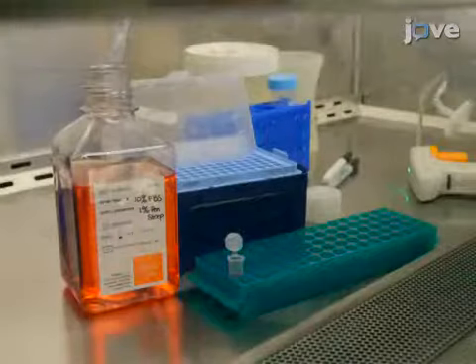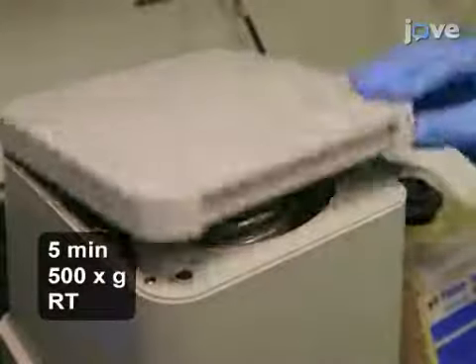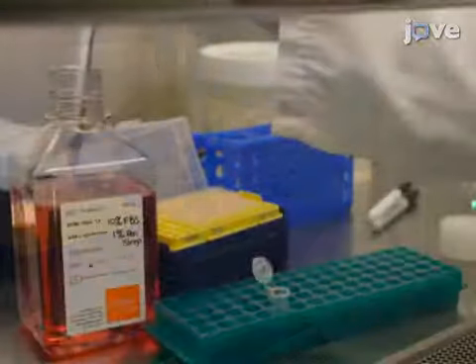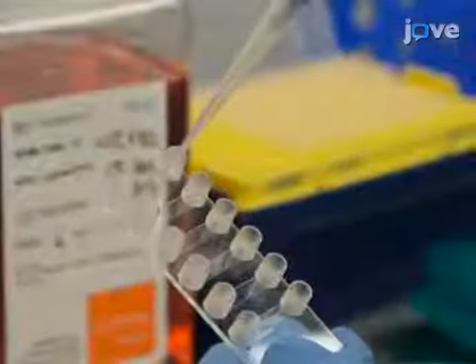Dilute the cells to a 0.75 x 10⁵ cells per chamber concentration and spin them down in a centrifuge. Next, re-suspend the pellet in 30 microliters per flow chamber in complete CHO iCAM culture medium and slowly seed 30 microliter aliquots of cells per reservoir of the flow chamber.